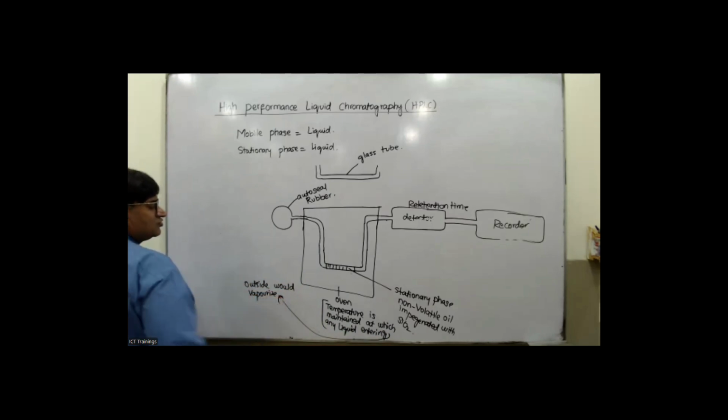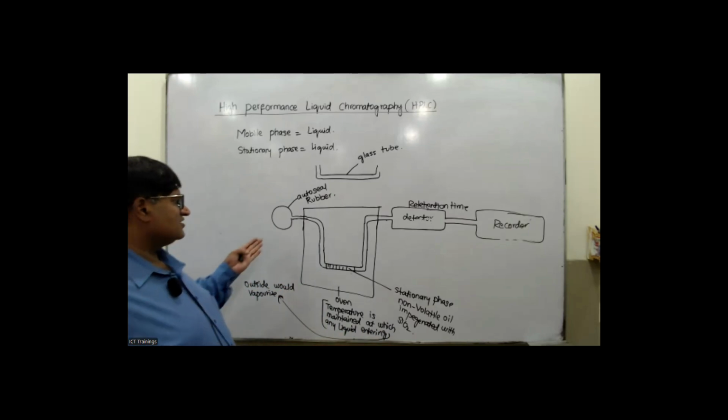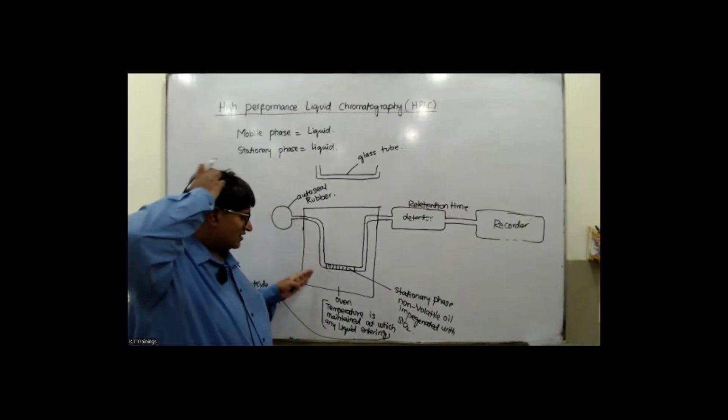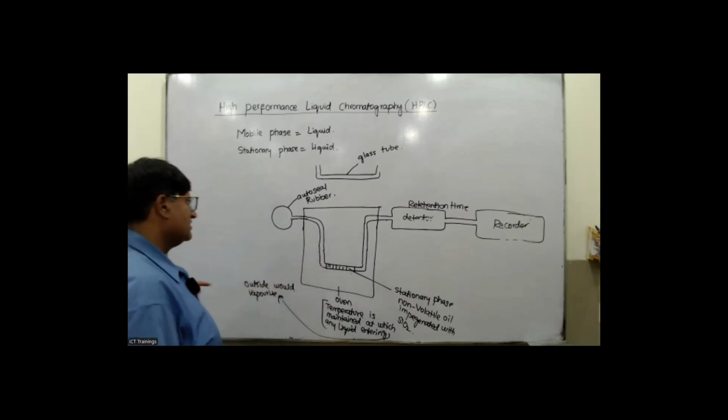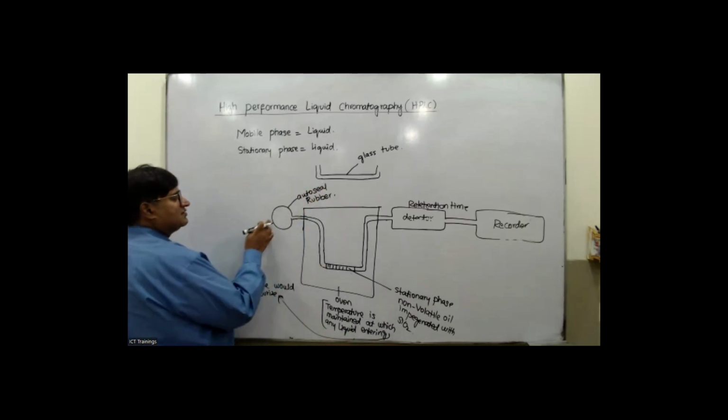Okay. So any of the liquid, my dear students, that is going to enter this tube would vaporize. So this is the auto seal rubber.